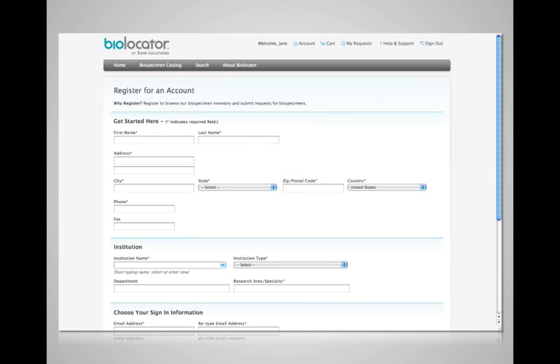You also control who can see your inventory. Each person who comes to find specimens must first register in your BioLocator installation. The registration process can be configured to gather as much information as you need, or integrated with your organization's system if you want to expose your inventory only within your own institution.